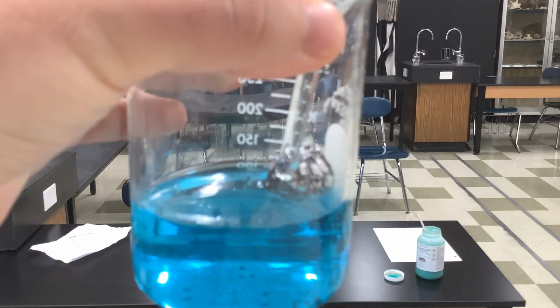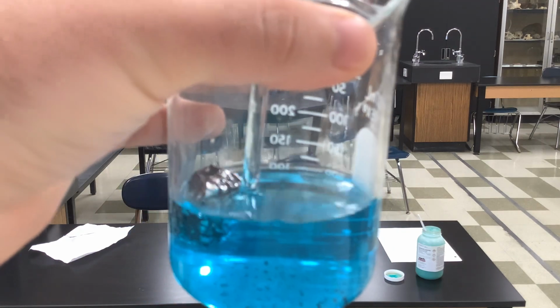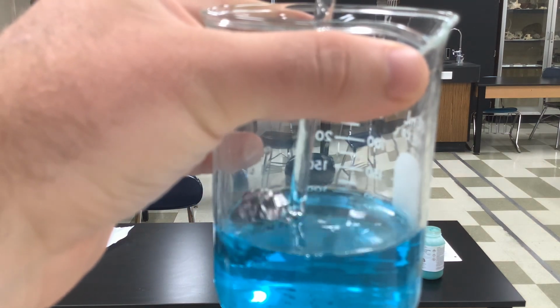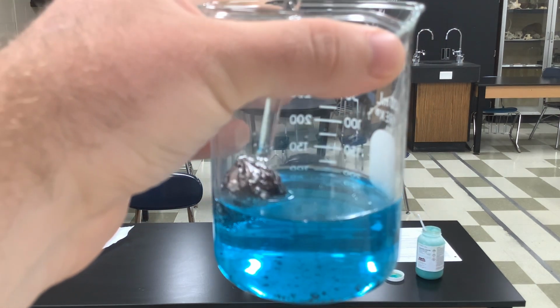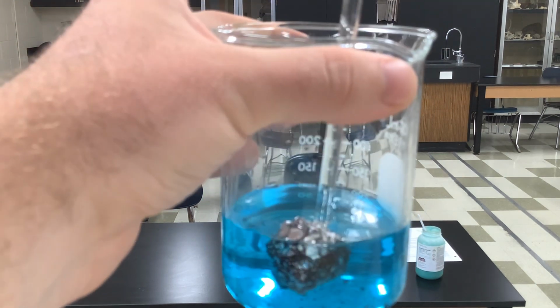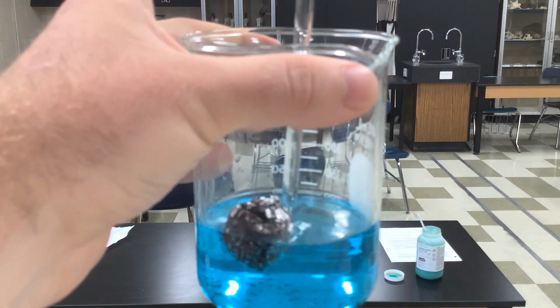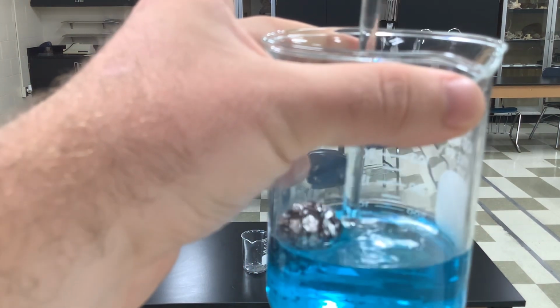So there it is. You notice that it looks like the outside of the aluminum is starting to turn a different color. It's starting to flake off. I'm trying to submerge it.